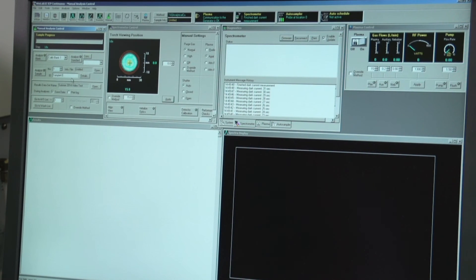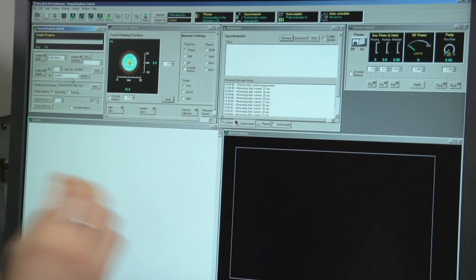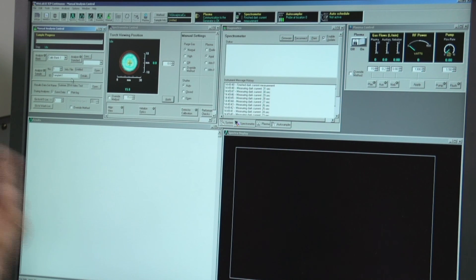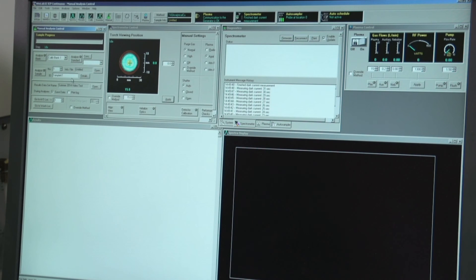When moving from solutions A1 to A2, you do not need to rinse the line as long as you are going from low to high concentration. But when going from A6 to the unknown solutions, or to solution A1P with the phosphate, always rinse the line with nanopure water when moving between solutions of different composition. Once finished with all copper data, move on to the zinc method.